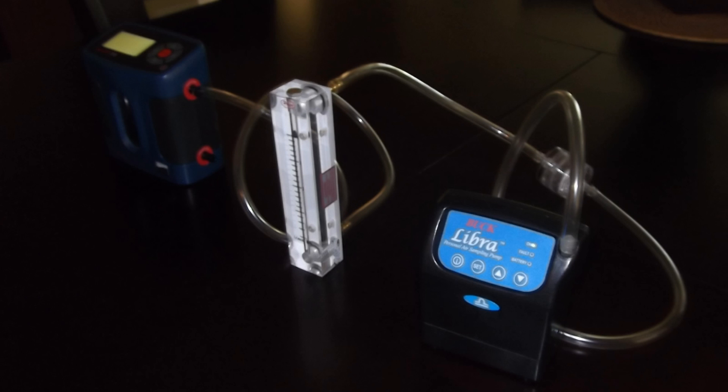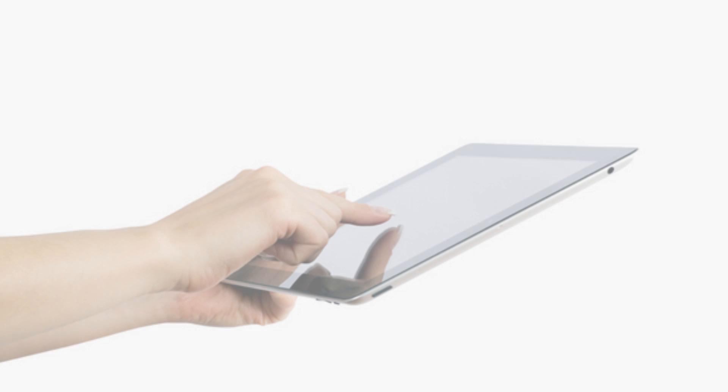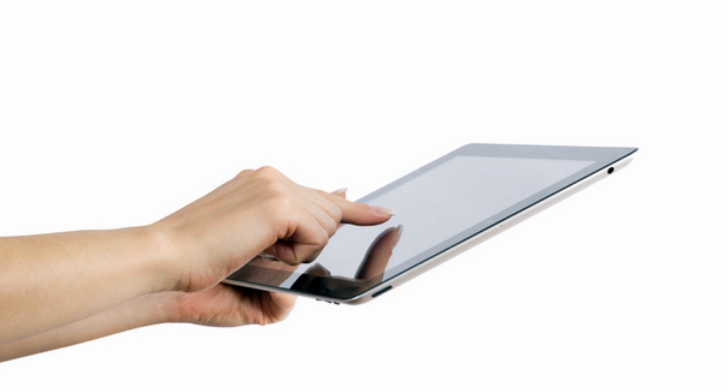To perform primary calibration of a rotometer and low-volume pump, first make sure the pump is fully charged before calibration. Refer to the pump manufacturer's suggestions for charging times.